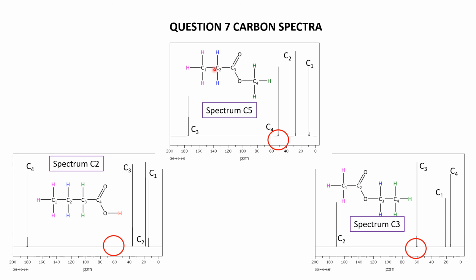And again what we see is that the CH2 is further downfield than the CH3 in otherwise equivalent situations. Again, looking at the carbon that's bonded to the ester carbon, CH2 here, closer to 30, CH3 here, closer to 20. Okay, so I'm fairly confident with my C3 and my C5 assignments just based on comparing the typical behavior of CH3 and CH2.